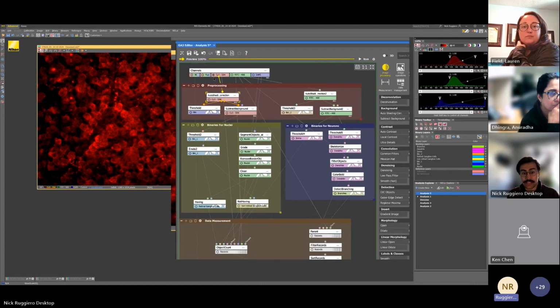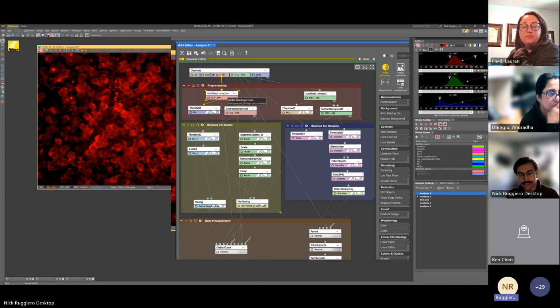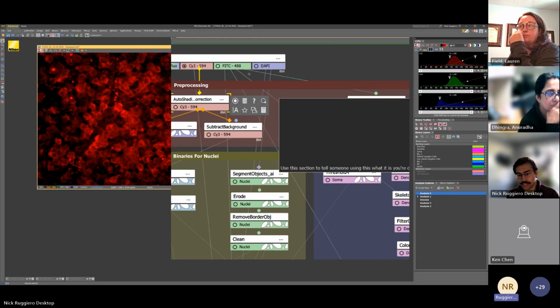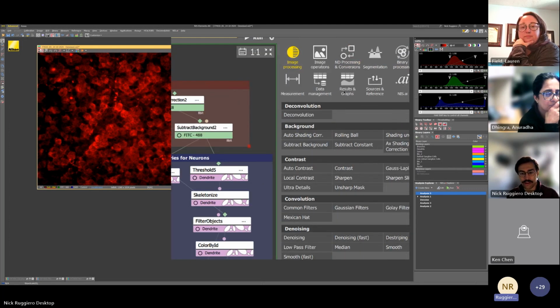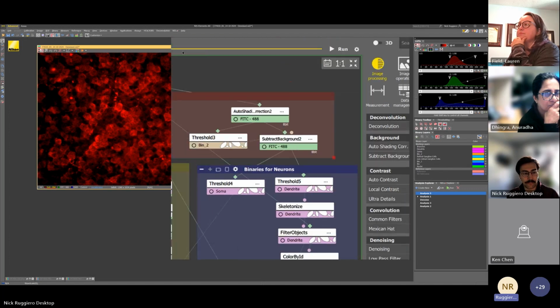And to find and navigate these functions, you can right click on the white section and it'll pop out this menu. You can locate any function by hitting the locate tab, and it will take you to where that function lives in the interface on the right side here.